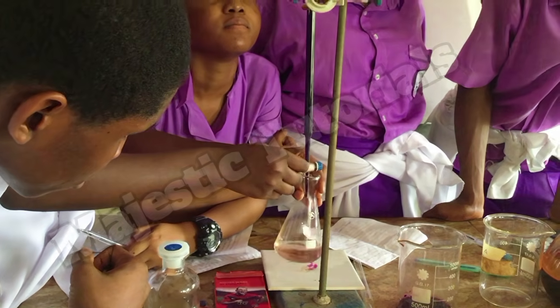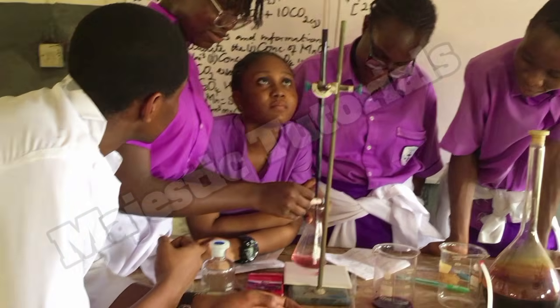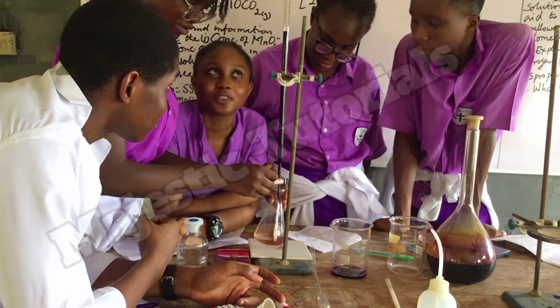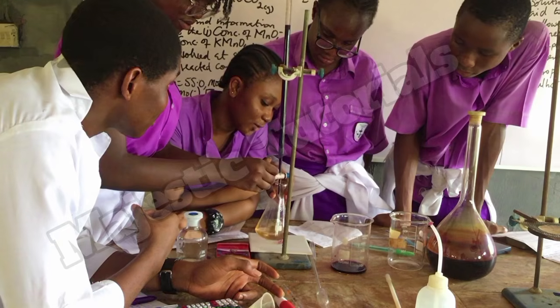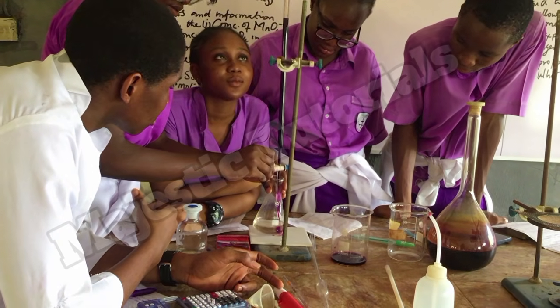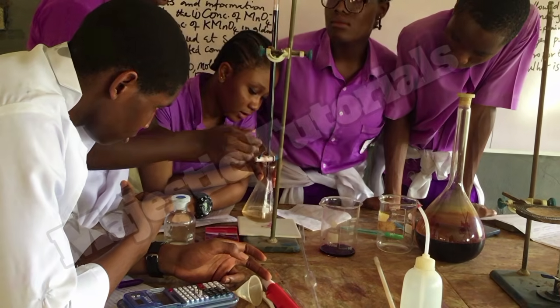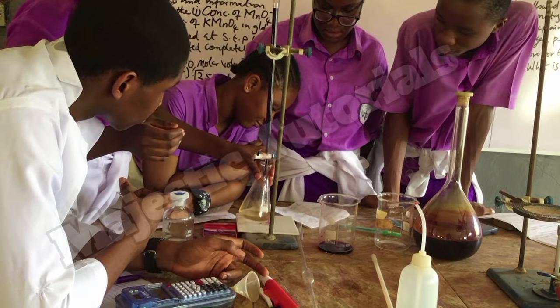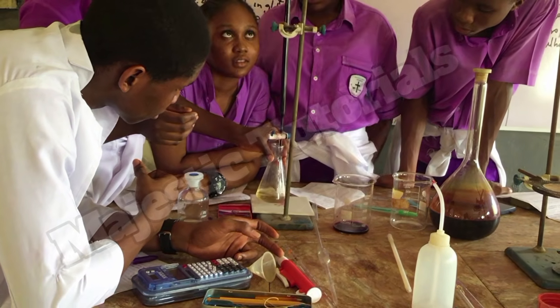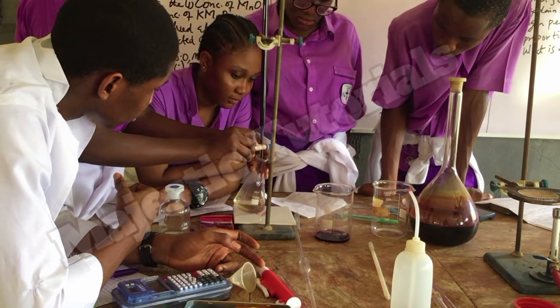Another challenge you might face in this titration is the dilute acid. That's the dilute H2SO4 you are using. They just say acidify with dilute H2SO4. My dear, if you use extremely dilute H2SO4, you will not get a color change at the right endpoint. You need at least 2 molar solution of H2SO4 or more. Because if you look at the equation of the reaction, 5 moles of the oxalic acid required 16 moles of hydrogen ion. So you need more of this dilute H2SO4 to protonate the redox reaction. If not, the reaction will be slow. Until you get a stable pink color, you have attained endpoint.